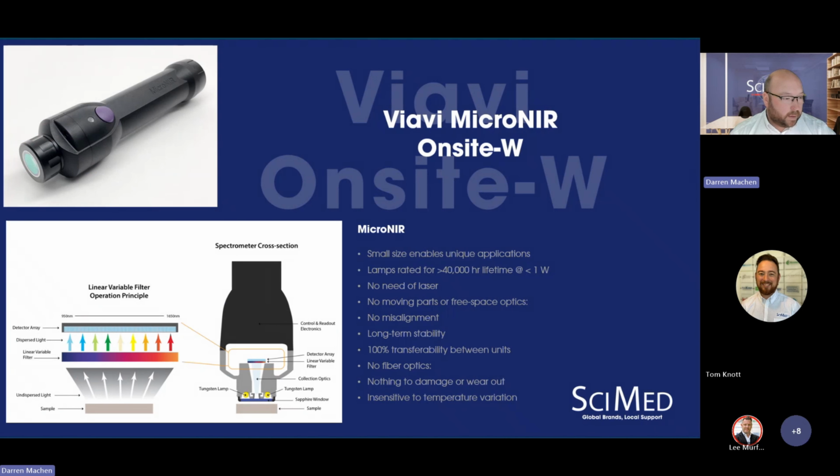And inside, just to help you understand what's happening, we have 2 tungsten lamps, which are reflected onto your sample, whatever matrix that is. The light is then reflected onto the detector. So this is the linear variable filter on here. This is the life work of VIAVI's optics, which is, quite crudely said, glued onto the detector.